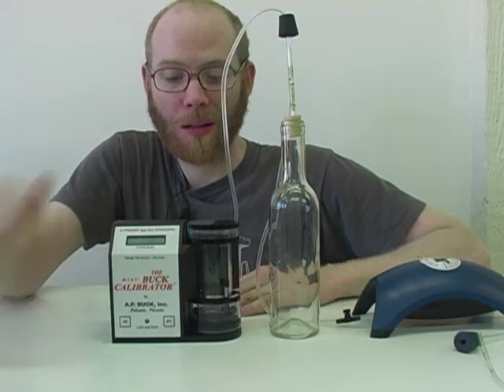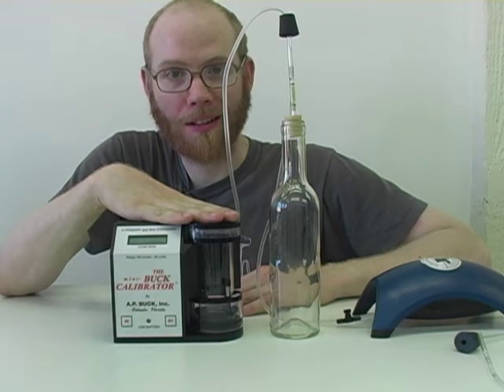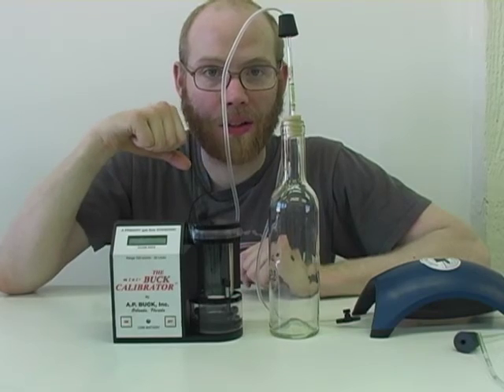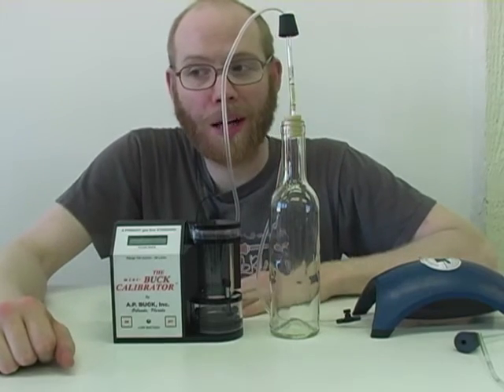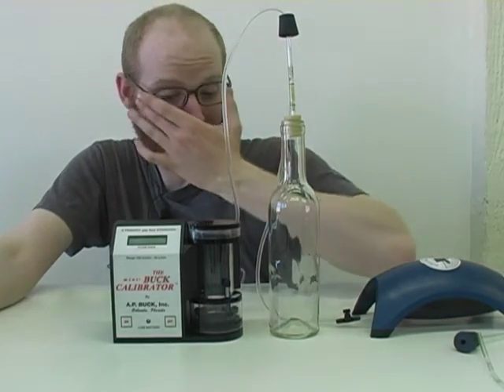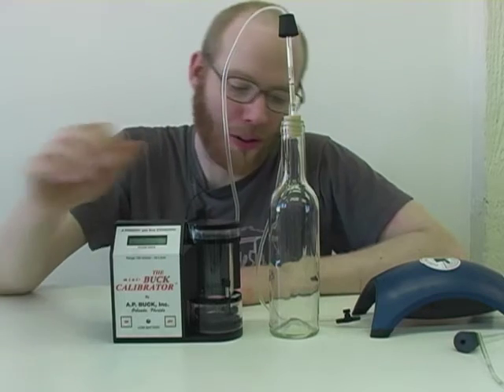Now let's see how well we've calibrated with this mini buck primary calibrator. It also runs on bubbles like our graduated cylinder method, but it has two automated sensors to time the transit of the bubble so it runs a little bit faster. It has similar problems with bubbles building up or popping before the measurement has been taken. We'll run a test and see how well our measurements correspond.